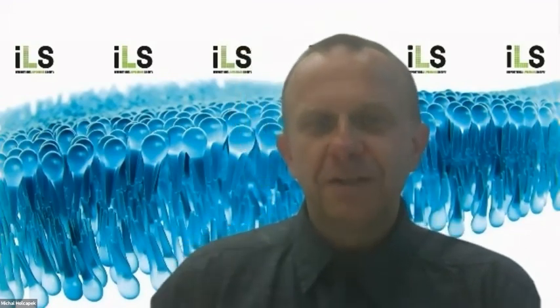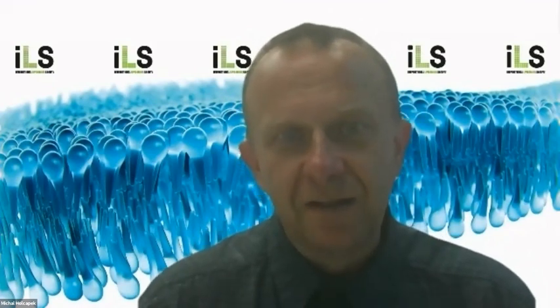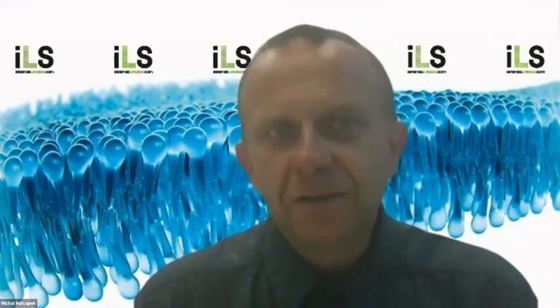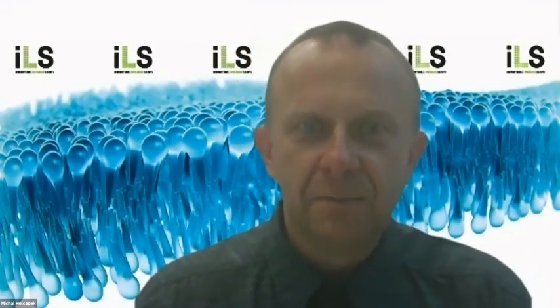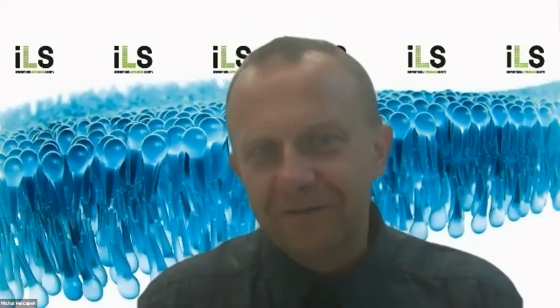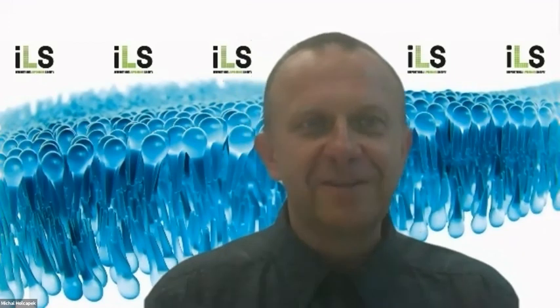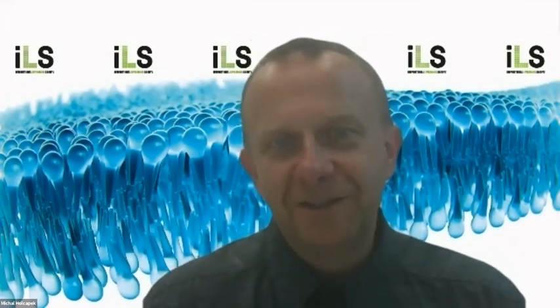Yeah. So for this reason, and these limitations are, I would say, fundamental, it's impossible to avoid them completely. You may reduce this dilution effect according to the approaches introduced by Peter Schoenmakers' group, but you cannot get rid of them completely. So with 2D, you will always report fewer lipids compared to 1D. This may not be evident to everyone, but for this reason I'm not the biggest fan of 2D, regardless of the fact that we do it and that we publish it.